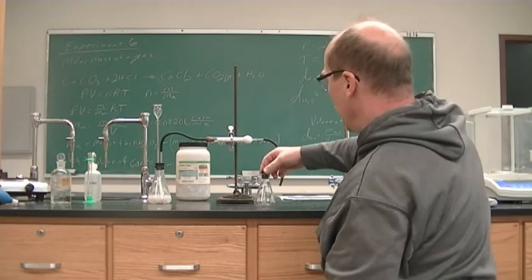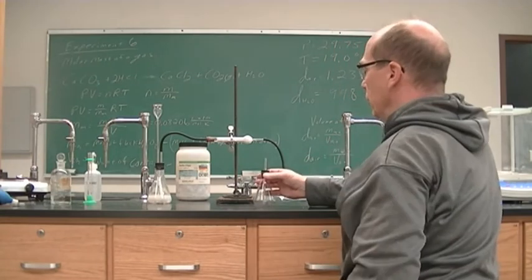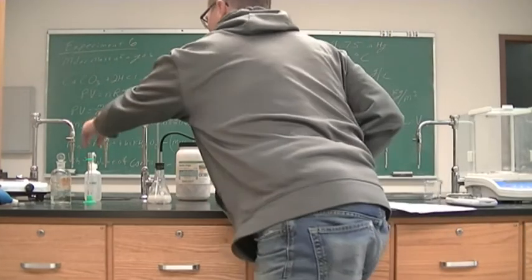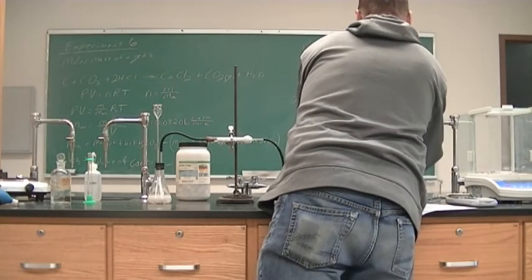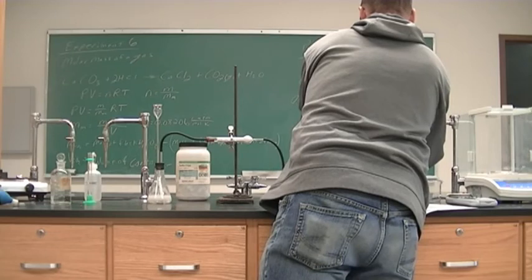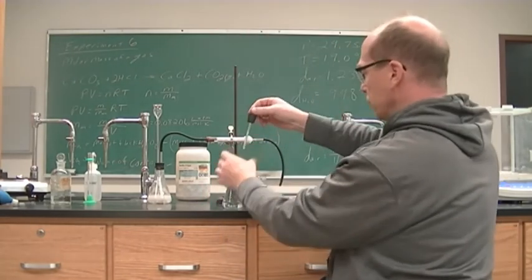All right, so now we have to fill this with water. So wherever there would be CO2, we need there to be water there. And so to do this, I'm going to fill it with water. All right, so this is full of water.